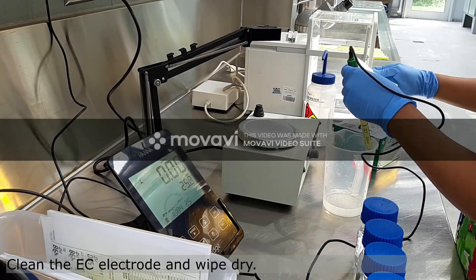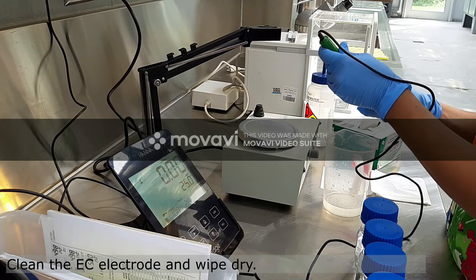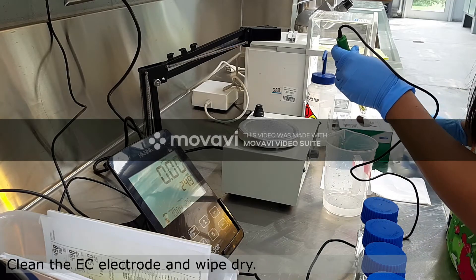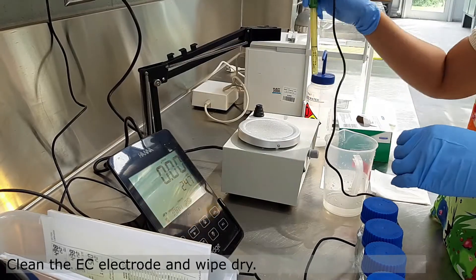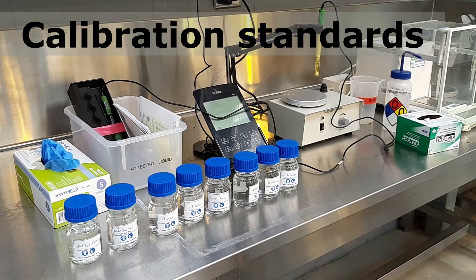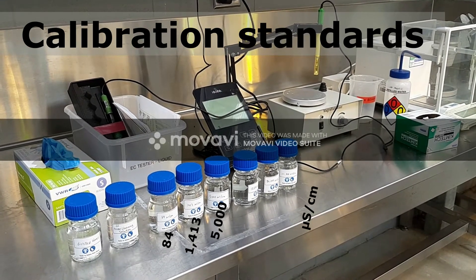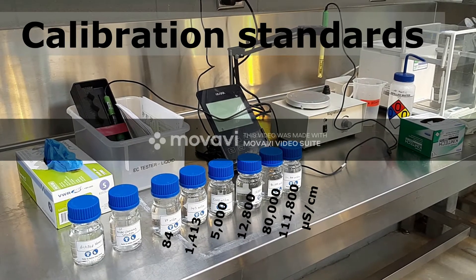If necessary, carefully flick water off your EC electrode. Now that we have a clean electrode, we can start calibration using one of our six standards. We have aliquots of 84 to 111,800 microsiemens per centimeter that we can use.